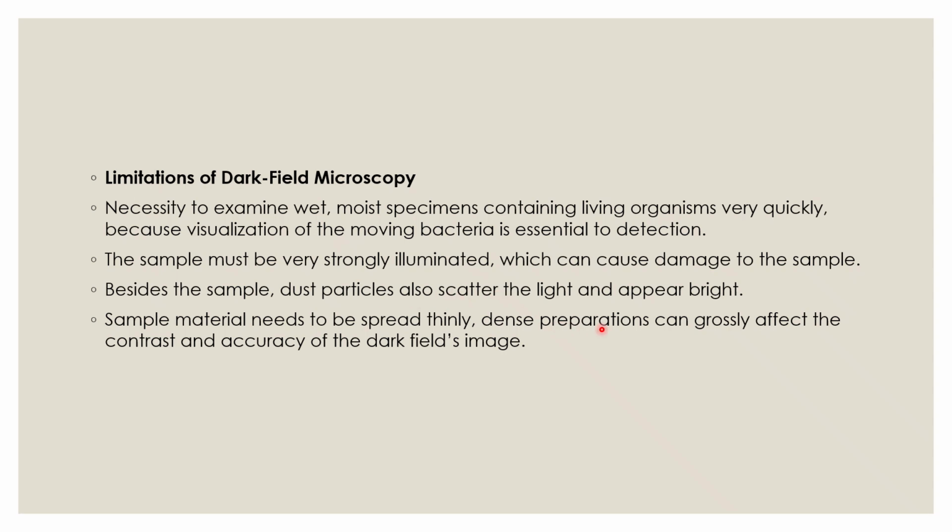Apart from this, sometimes there are accidentally some dust particles on the slide, so the particles also start illuminating and scattering the light, and they also start appearing bright. At that time you cannot differentiate whether it is an organism or a dust particle. So that is one limitation or disadvantage over here.